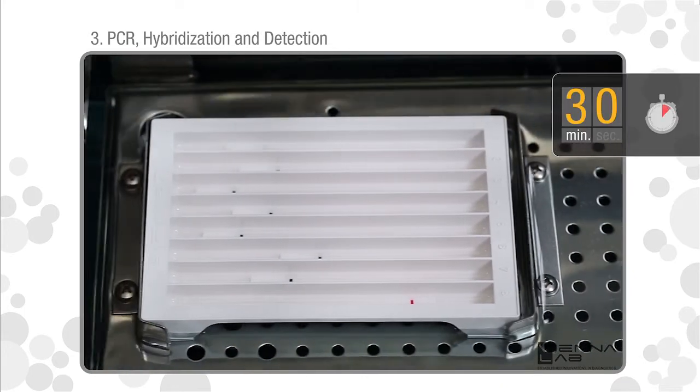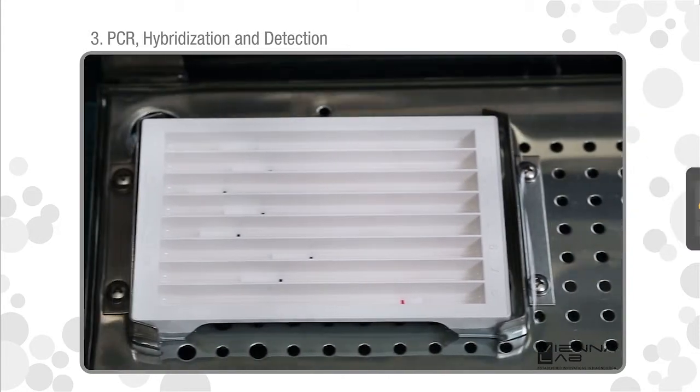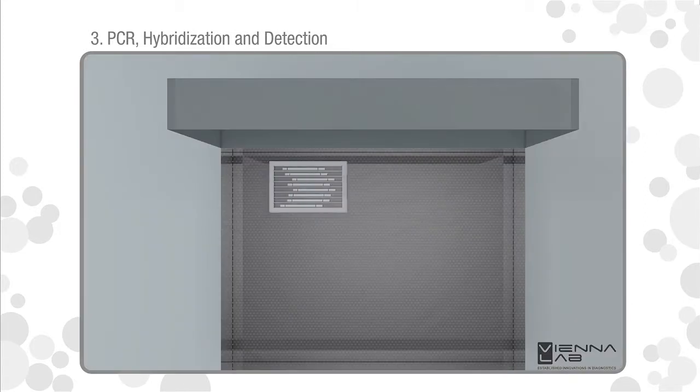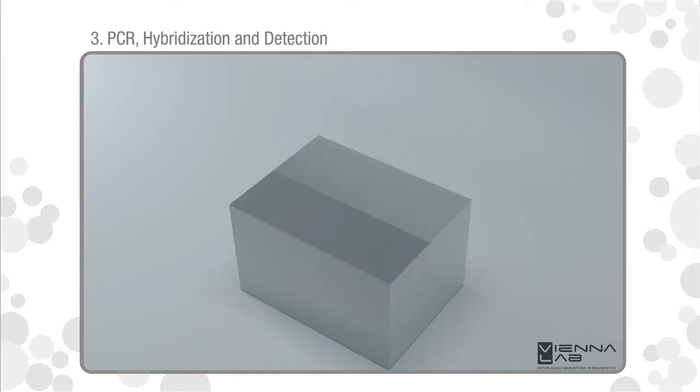Incubate for 30 minutes at 45 degrees Celsius on the shaking platform of the water bath. Set moderate shaking frequency to avoid spilling. Keep the cover of the water bath closed to avoid variations in temperature.